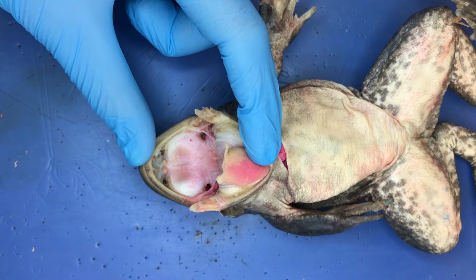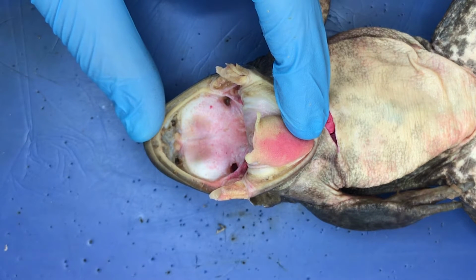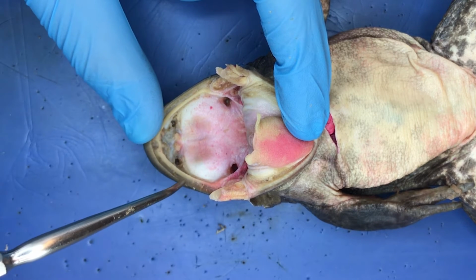Now that we have exposed the oral cavity, we can begin to identify the structures within from this ventral view. First, we see the uniformly shaped conical teeth located in rows.